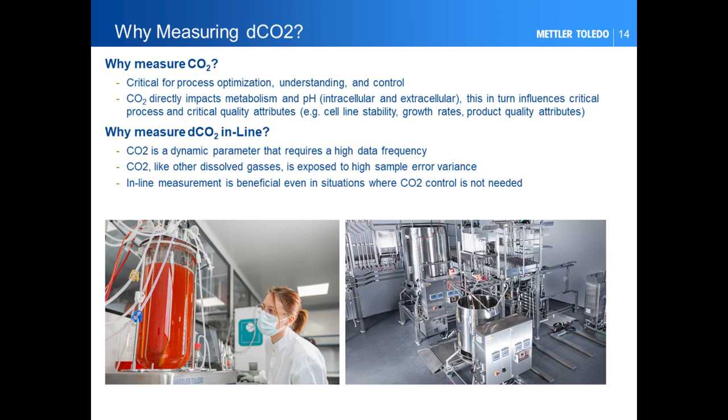So from the bench to very large scale, in suspension, including various single-use bioreactor designs, the CO2 impact will be different. So it's important to qualify the dissolved CO2 in order to monitor and control its accumulation in media at various scales and various bioreactor designs.